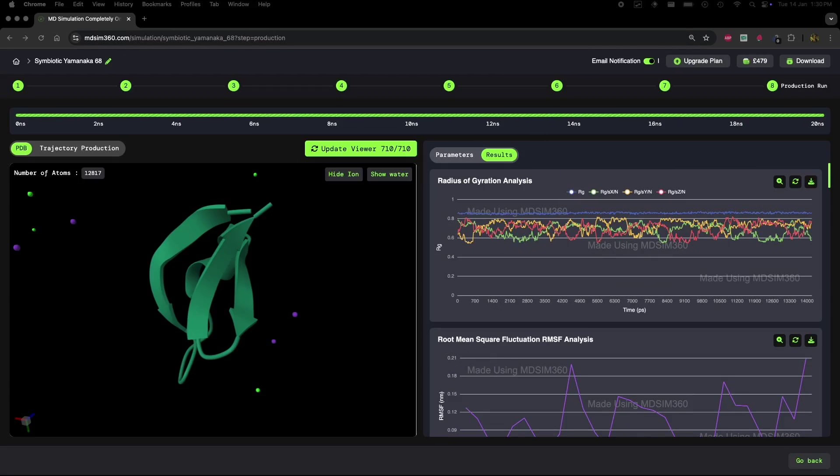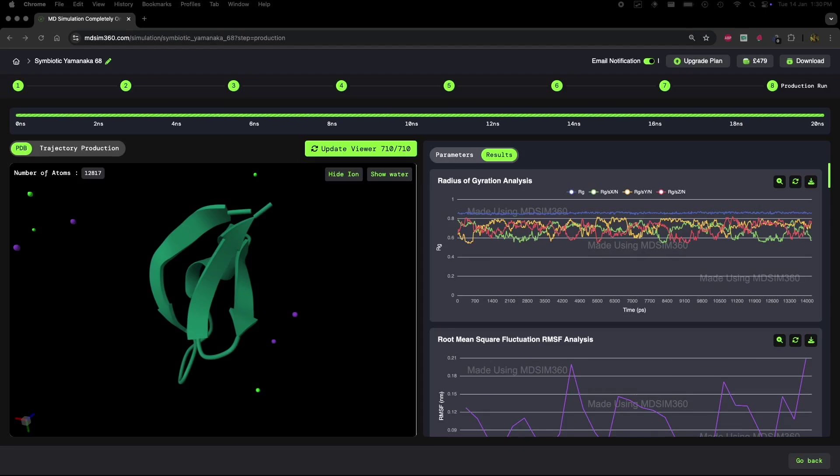Even though the radius of gyration suggests stability, there's actually a subtle unfolding process happening inside the protein. I'll walk you through how to identify these changes and why the radius of gyration alone might not give us the full picture.